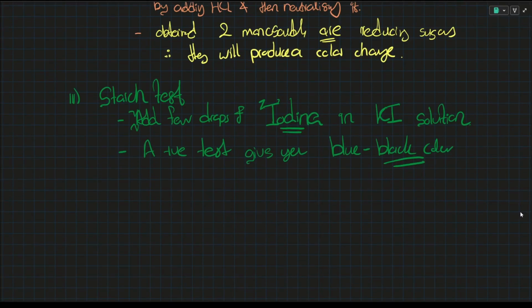Moving on to how we're going to test for proteins. The proteins have an interesting test. You call it the Biuret test. This is a very common misconception: don't say "Biuret" as in the piece of laboratory equipment. We're not talking about that burette. You have to pronounce it in the form Biuret, B-I-U-R-E-T.